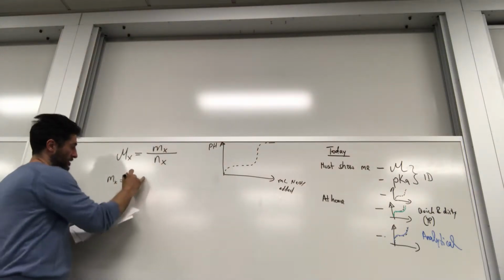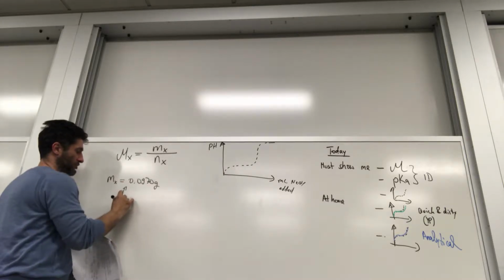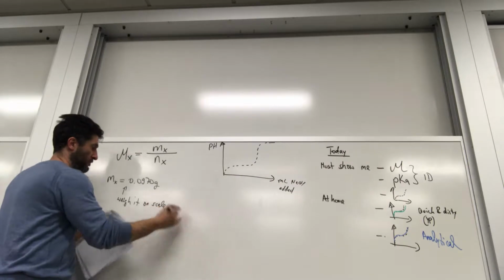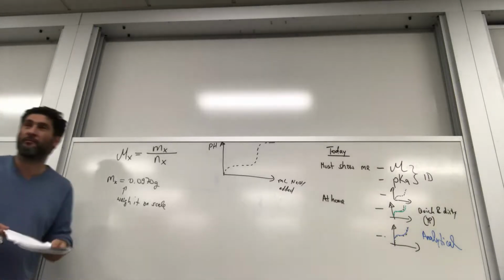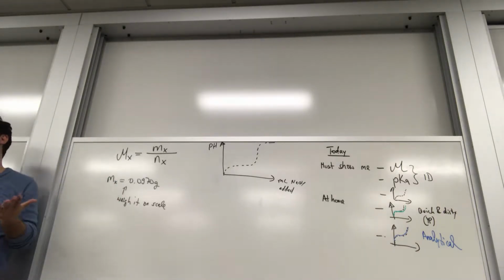And let's say, for example, you have a number of about 0.1 grams, right? Something like this, right? That might have been different for different people with different acids, depending on how much volume you needed to equivalent. So we have the mass, but I need the moles of the unknown acid.